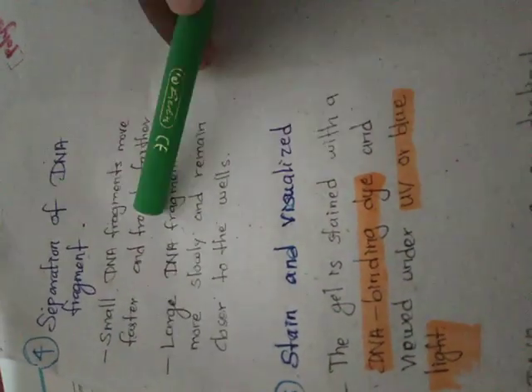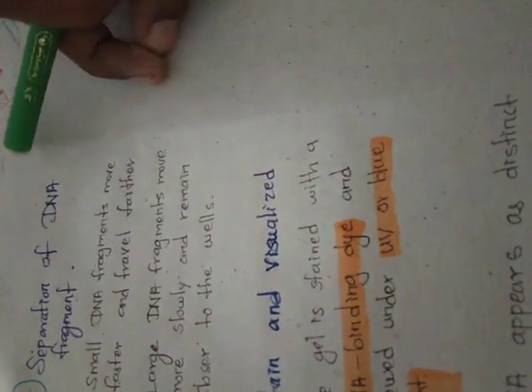Which fragment is big? It is near the negative side, the starting point. Which is the small particle? The small fragment goes further from the starting point.